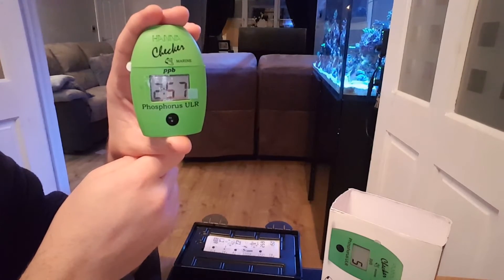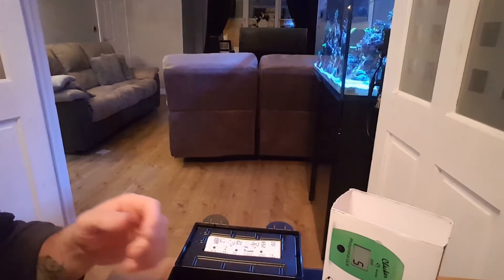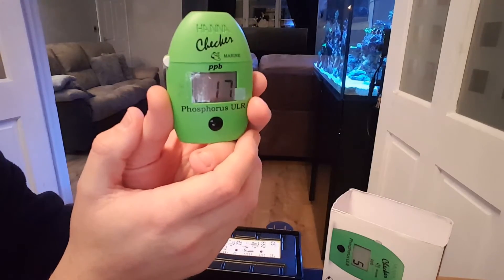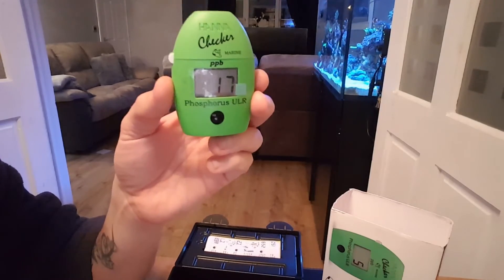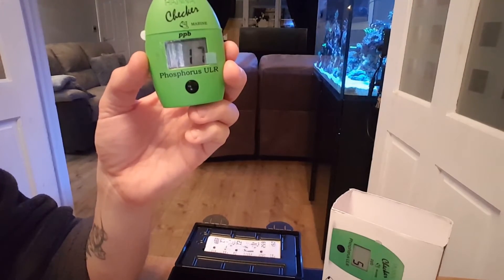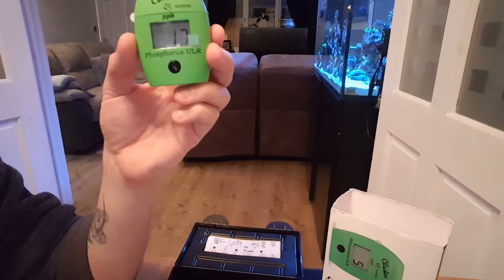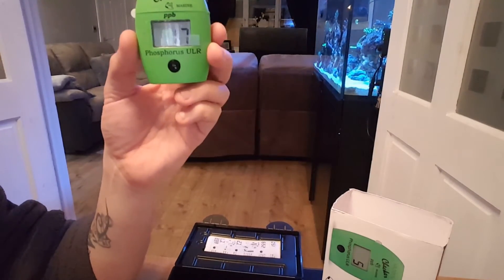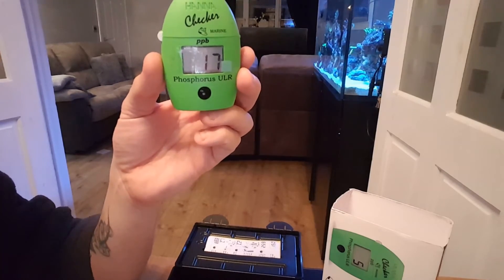Press and hold. You've got a three-minute countdown. Let it count down three minutes. The reading is 17 — so that's 17 parts per billion. If you wanted to convert that into phosphates, you'd take 17, times it by 3.066, then divide by 1,000. And that gives you 0.05 on the phosphates.